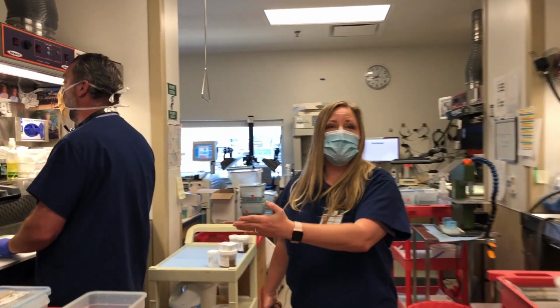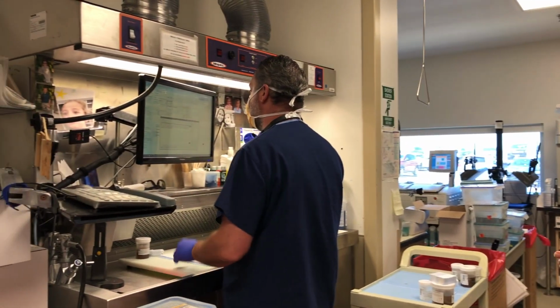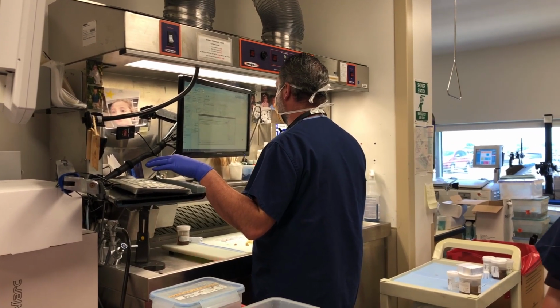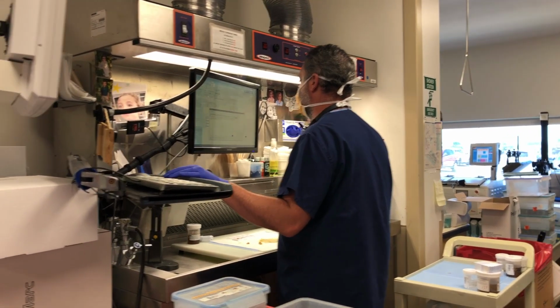We've got some dissection happening here. Paul is taking a very large specimen and actually putting the very important pieces of each of those into blocks, which those blocks will become our slides later.